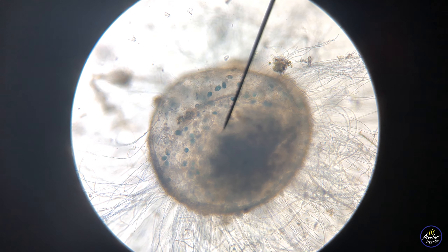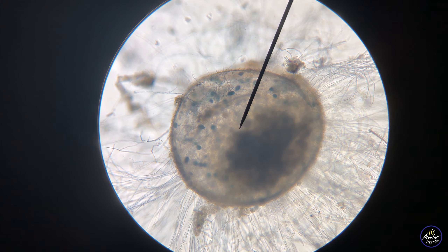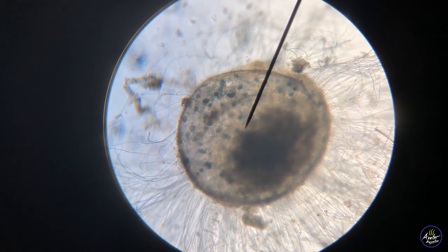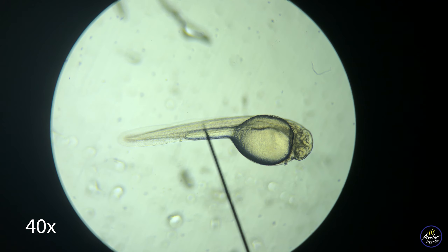And this is an unfertilized egg — you can guess what the fuzzy stuff is. Those little blue ciliates are blue because the methylene blue dyed them, and they're still alive. Look at that paramecium. And if everything goes right, within two to three days this is what we see.